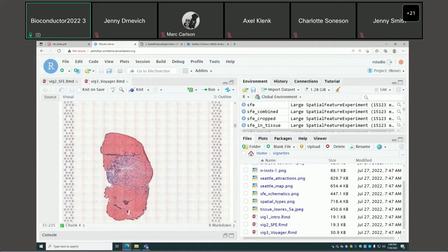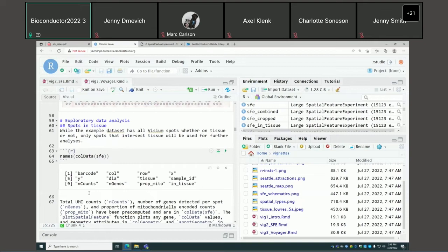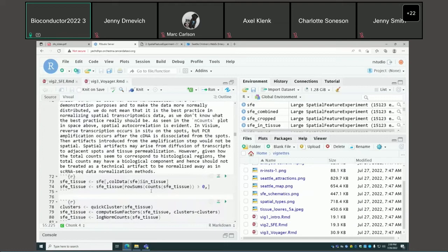This is the H&E image of the dataset. The pink part shows myofibers, and this is the injury site with a lot of leukocyte infiltration. This feature is the muscle-tendon junction. Some QC metrics have already been pre-computed: total UMI counts, number of genes detected per spot, proportion of mitochondrial counts, and a logical vector indicating whether each Visium spot intersects the tissue.